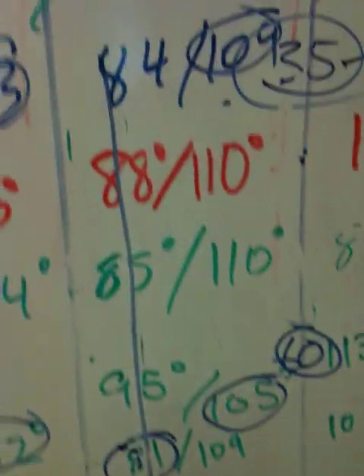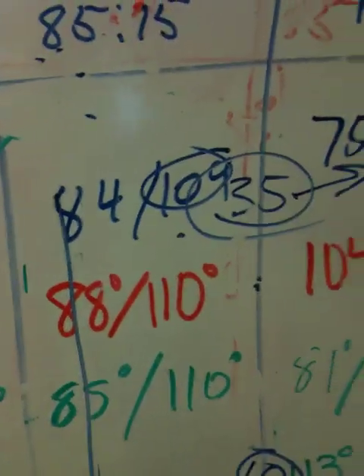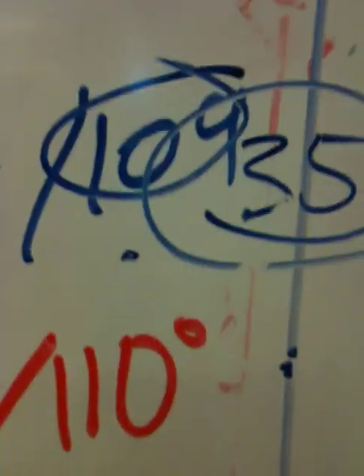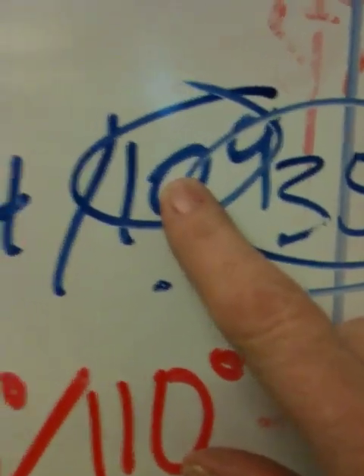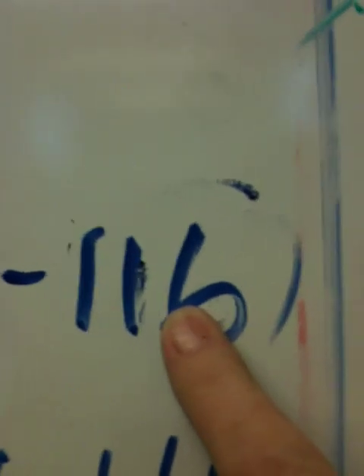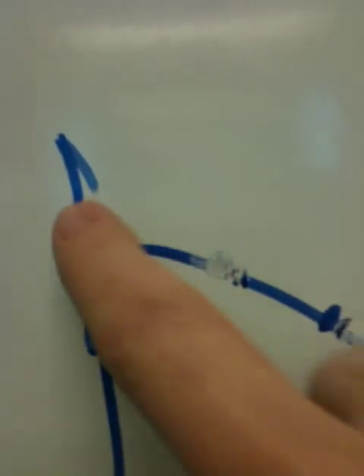So we decided that we could kind of throw that piece of data out and look at the upper numbers. And basically what we did was we checked out whether or not people's upper numbers would work well on the graph. So for example, this is an 85.15. It ends at 109. The corresponding 95.5 ends at 113, and the pure ends at 116. And this would constitute the upper points on this curve. This is what we expect for those numbers to go up.